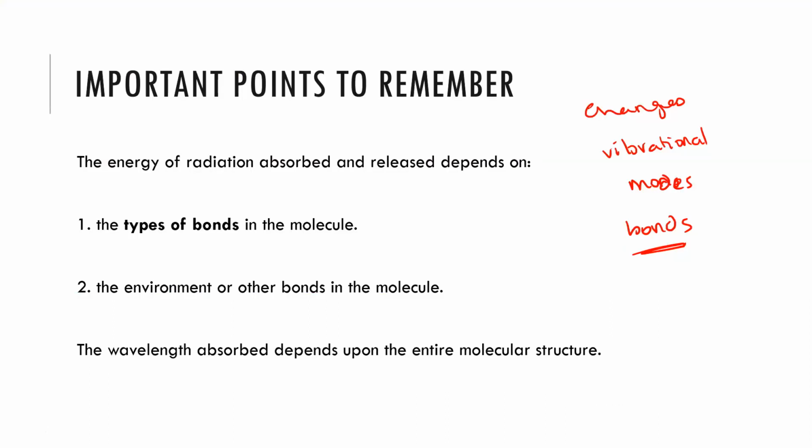Next up, we will be looking at interpreting of spectra, and we'll go through looking at some of these characteristic peaks and what information we get from them.